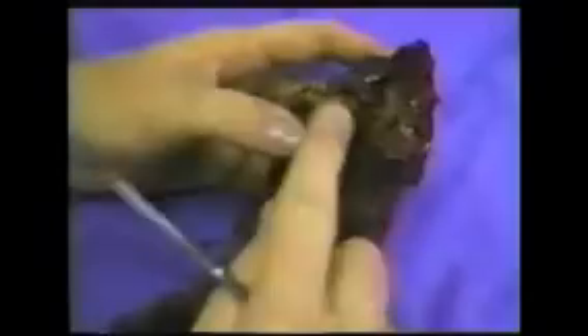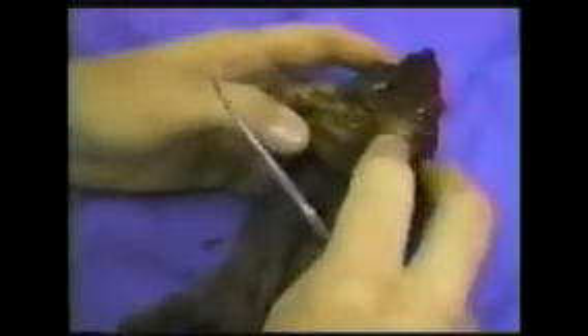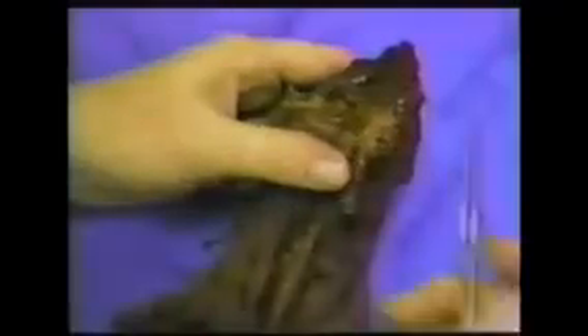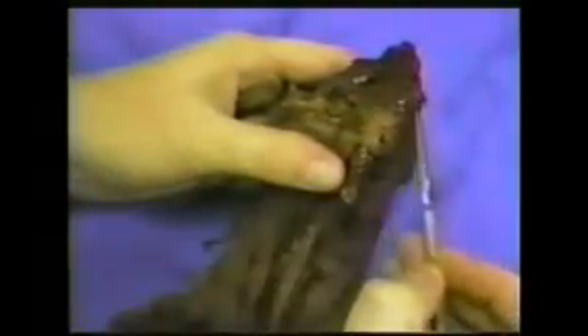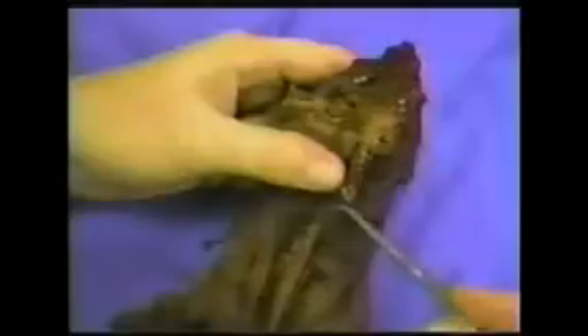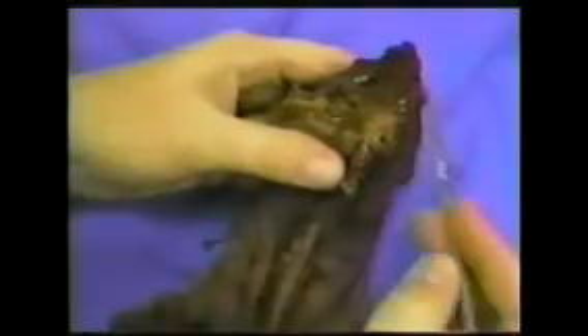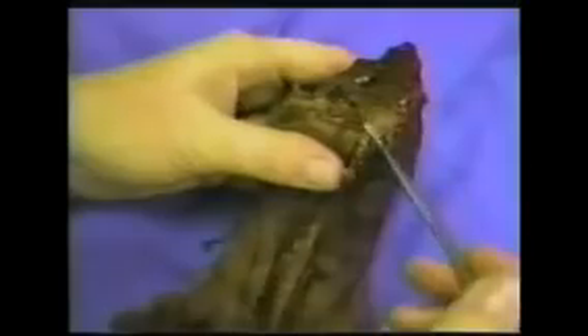Let's start up with the mouth and work through the digestive system and body parts. Here we have the mouth of the mink split open so that we can see the different parts. The first thing we need to talk about is the dental formula. The dental formula of the mink is 3-1-3-1 on the upper jaw and 3-1-3-2 on the lower jaw. You can study that and find out what each number stands for.